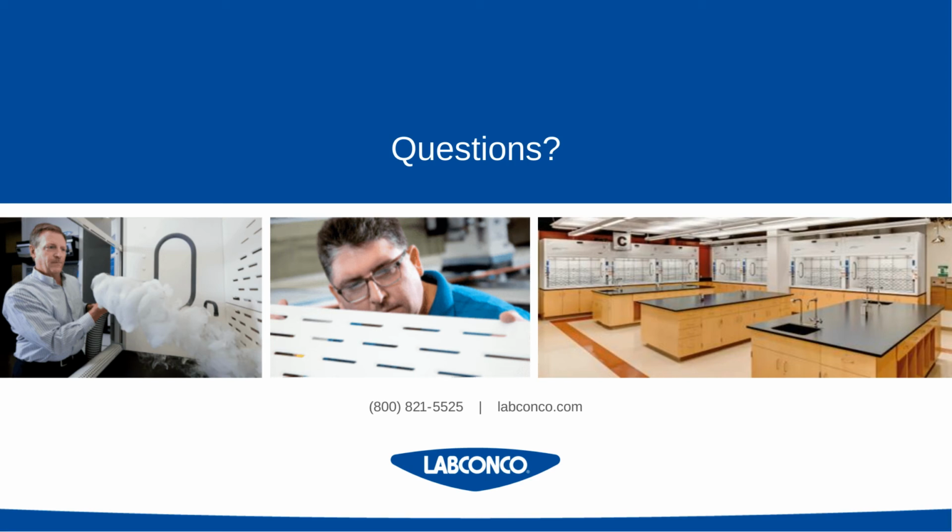The typical cost of those filters ranges widely, and I'm not sure I can really speak to that. But I didn't include the cost of the filters for the hoods because I also didn't include the cost of the maintenance for the ducted hoods. So we'd consider that a maintenance cost associated with those hoods. And for the sake of this presentation, it was exclusively about conserving energy, and I chose dollars to help quantify those numbers. Definitely, the ductless hoods have that added maintenance cost associated with them because ducted hoods do not have those. But as far as the reduction of energy consumption, I decided to leave that off because I didn't include maintenance in any of the cost comparisons in the presentation.